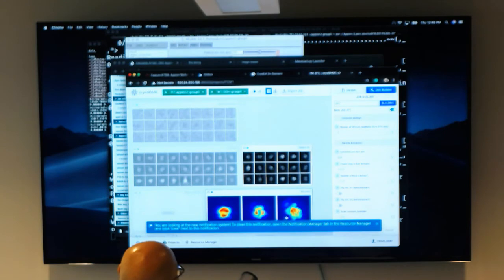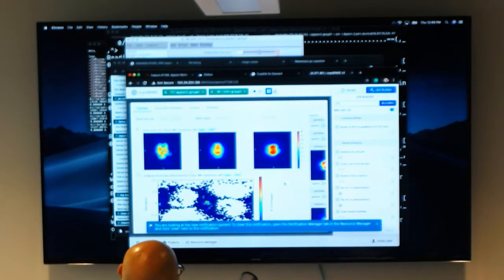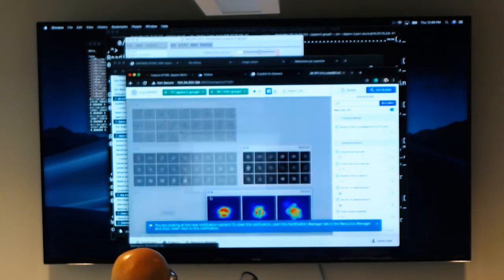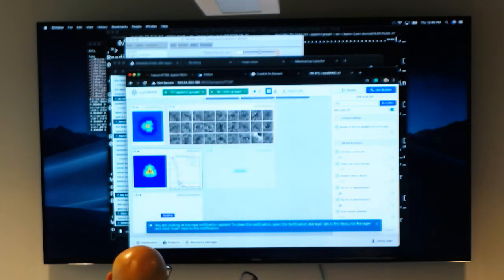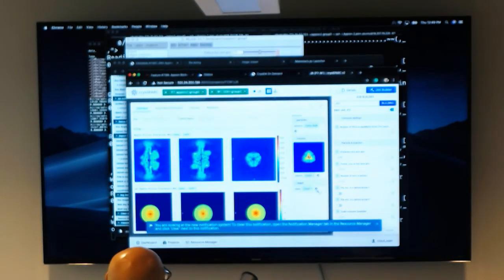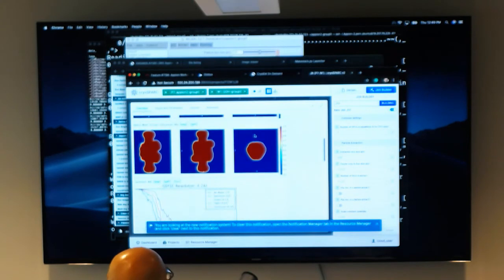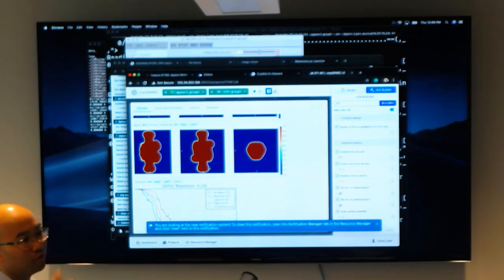So meaning if I had a tight mask, a tight mask of this would not be a sphere. In this case it would be more triangular, and in this view it would be more rectangular. It would have a shape. And in this case, in the refinement, it has actually created a tight mask where it looks like this, where this is more triangular and this is blocky with a couple lobes. So it's no longer a sphere mask. The mask actually has a shape.